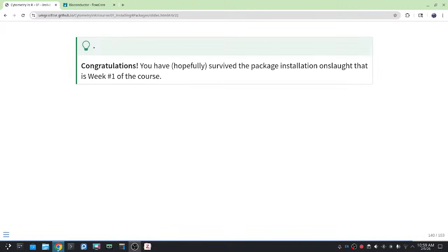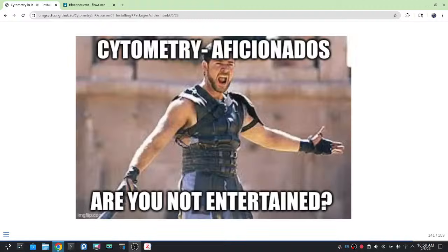So, congratulations, everyone. You have survived the first week of the Cytometry in R course. And my question for you at this point is, are you not entertained? Now, for those who were here in person over this last week, looking around the room, this is where I see people are nervous. Everybody seems a little bit confused, and I just want you to know this is perfectly normal.